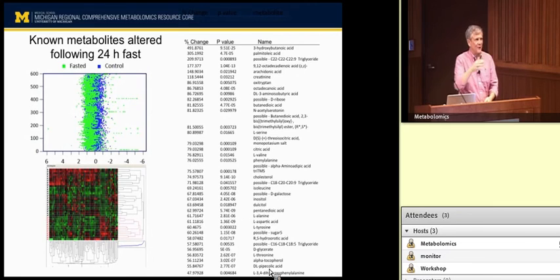TM will tell you exactly how it's done, but the lipidomics will give you specific subclasses and chain lengths of lipids, and you get up to 1,000 or even more of those. There's a lot of data in there that still needs to be sorted out. In the untargeted platform there are lots of lipids. A lot of the stuff coming out late in the chromatogram are clearly lipids, but they're hard to identify because the molecular masses of these things can be a number of different things.